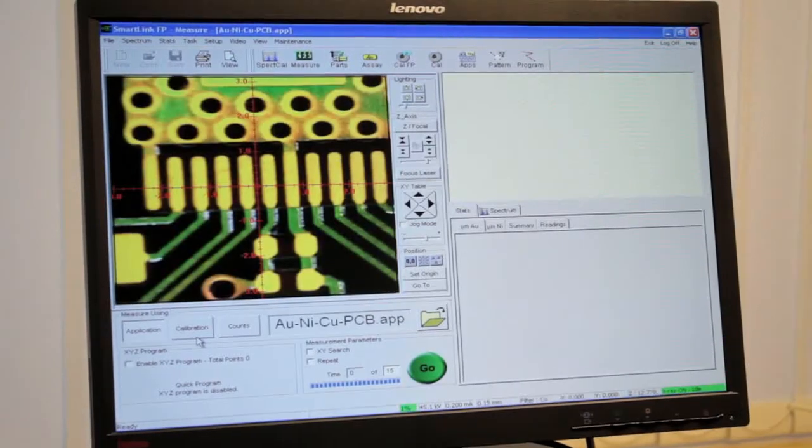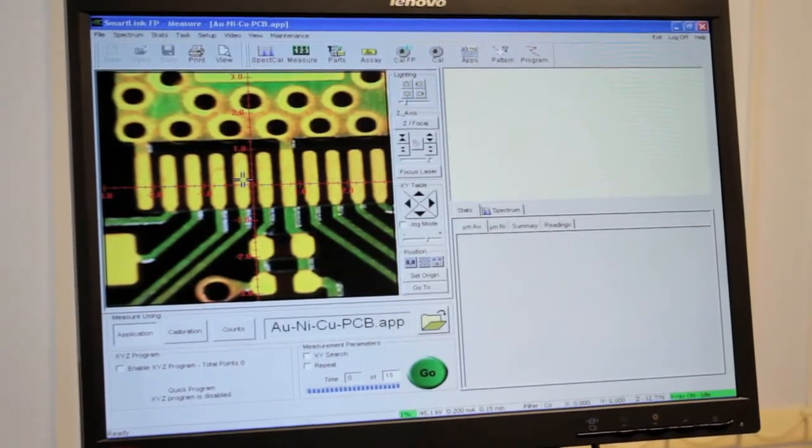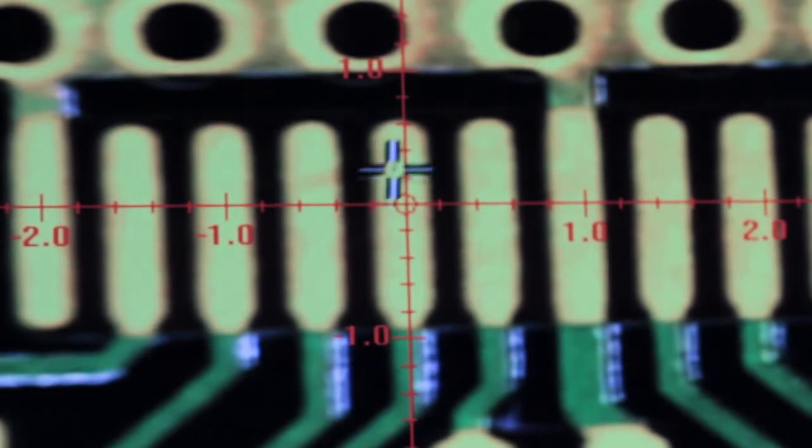The instrument camera gives a clear image of the sample. Using the instrument software, simply move the sample to the required position using the crosshairs on the screen.